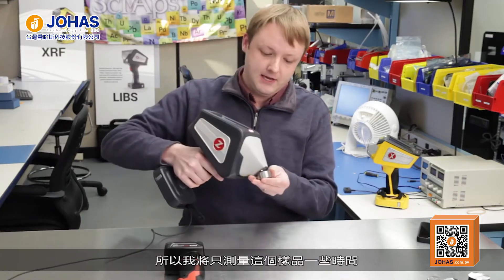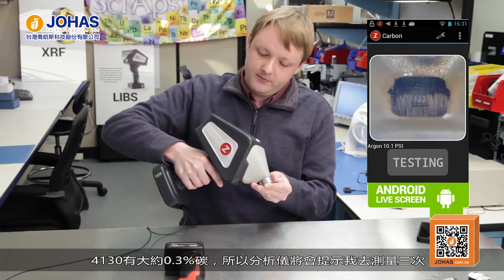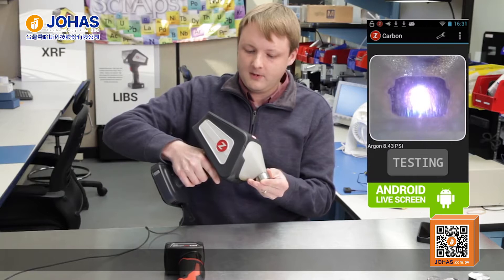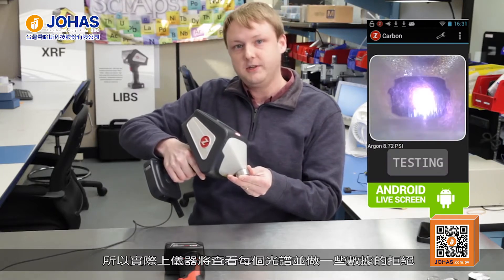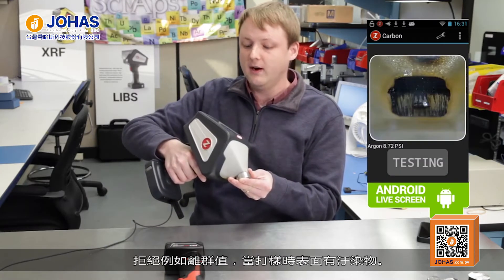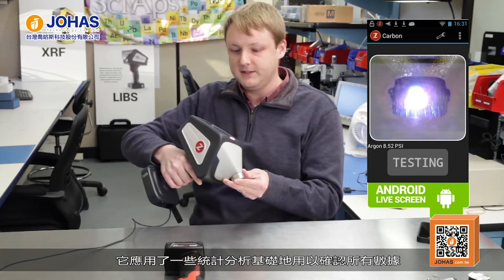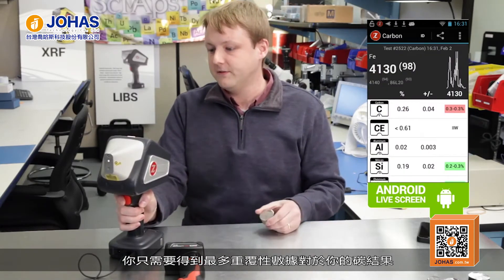For testing carbon, we usually do an average of a couple of results just to make sure we can improve precision as much as possible. I have a 4130 sample here, so I'll just test this a few times and we'll see the carbon value. 4130 has about 0.3% carbon, so the analyzer is going to prompt me to test a few repeats. The analyzer is actually looking at each spectrum that comes in and doing some data rejection in case there happen to be any outliers or you happen to hit a spot that has some surface contamination.